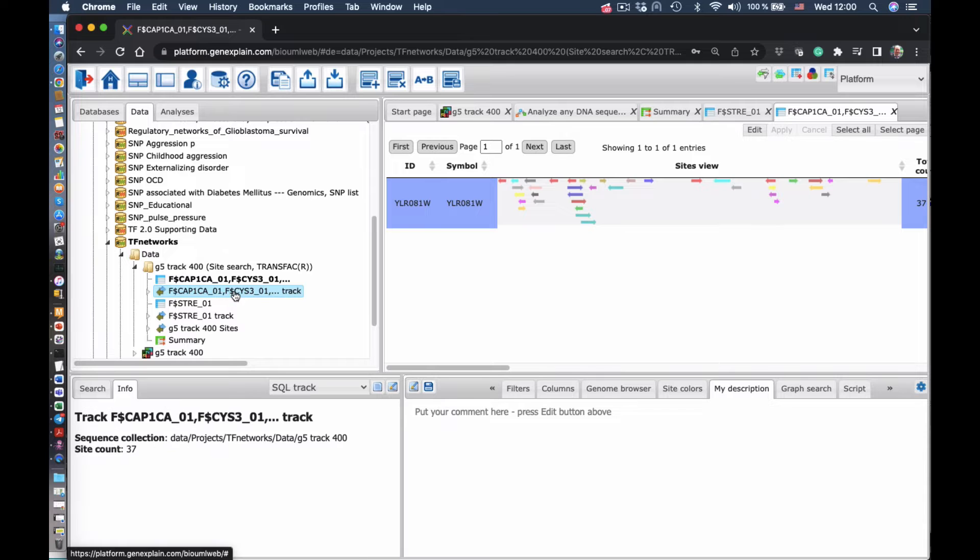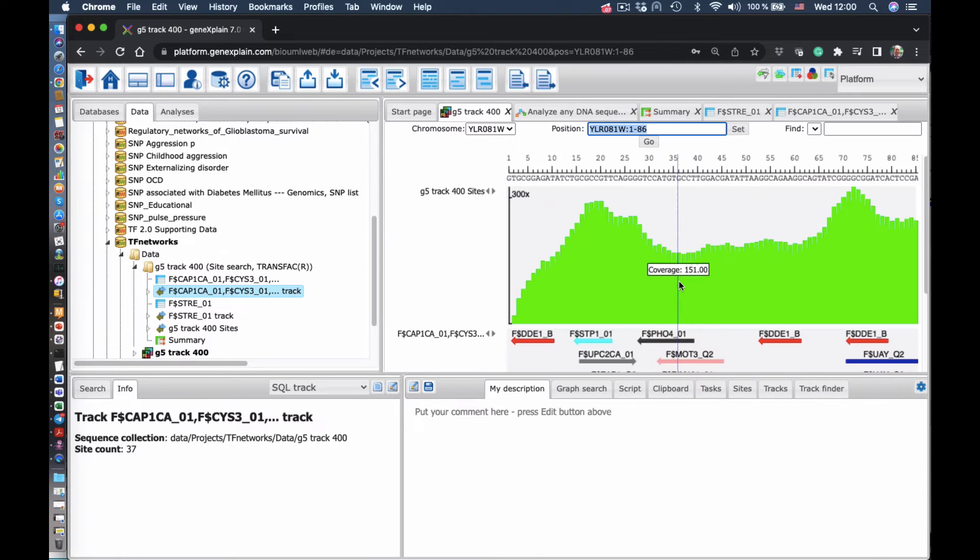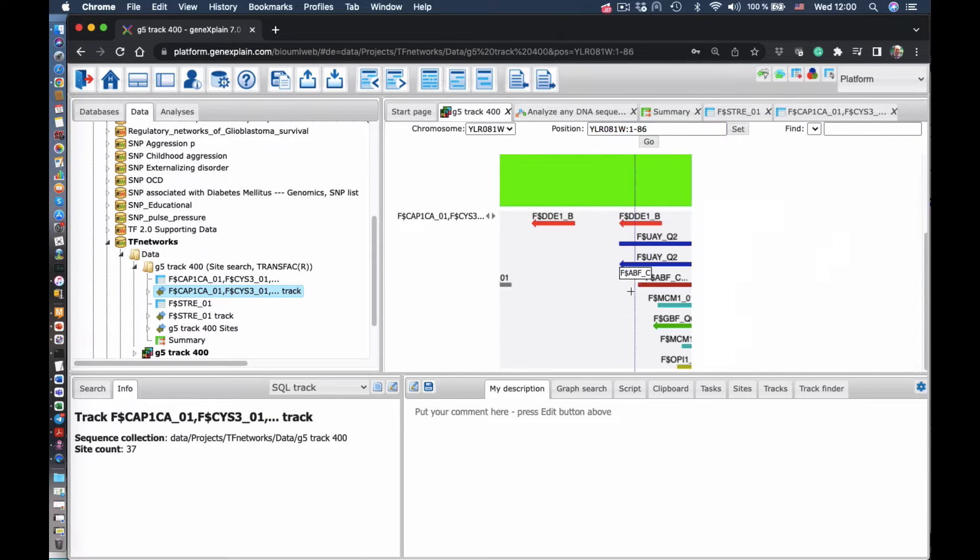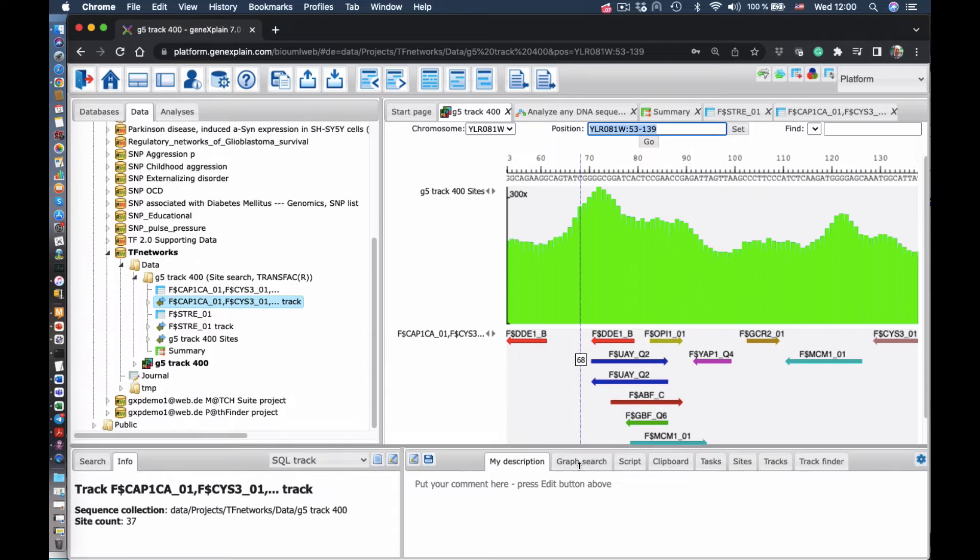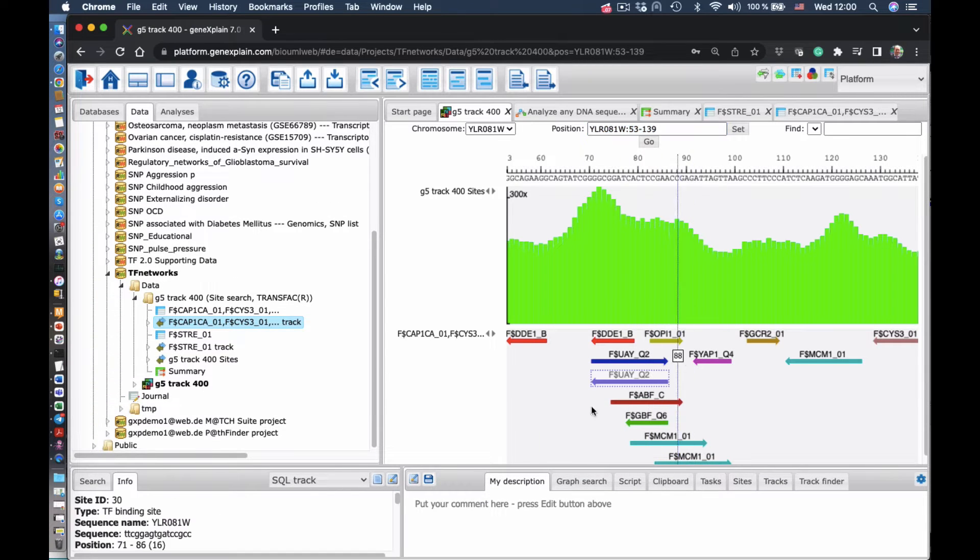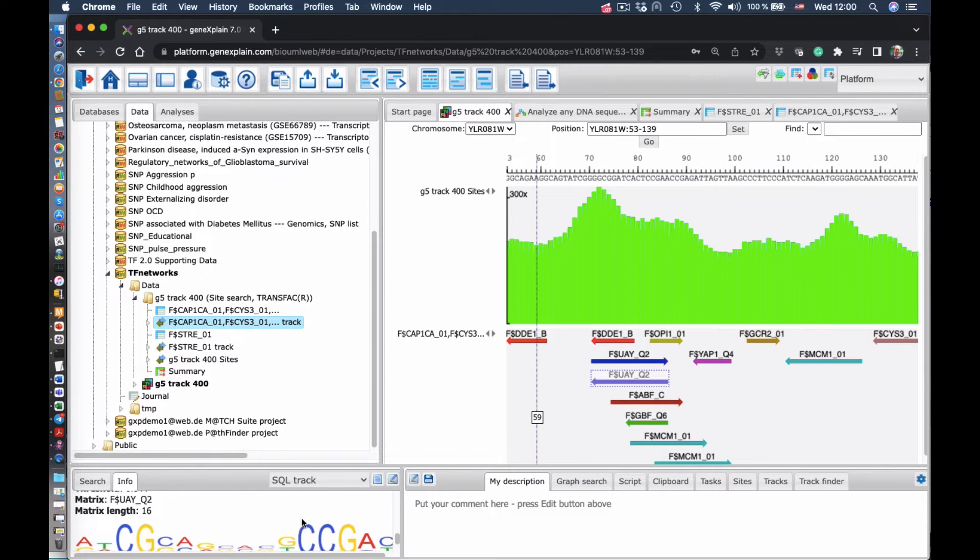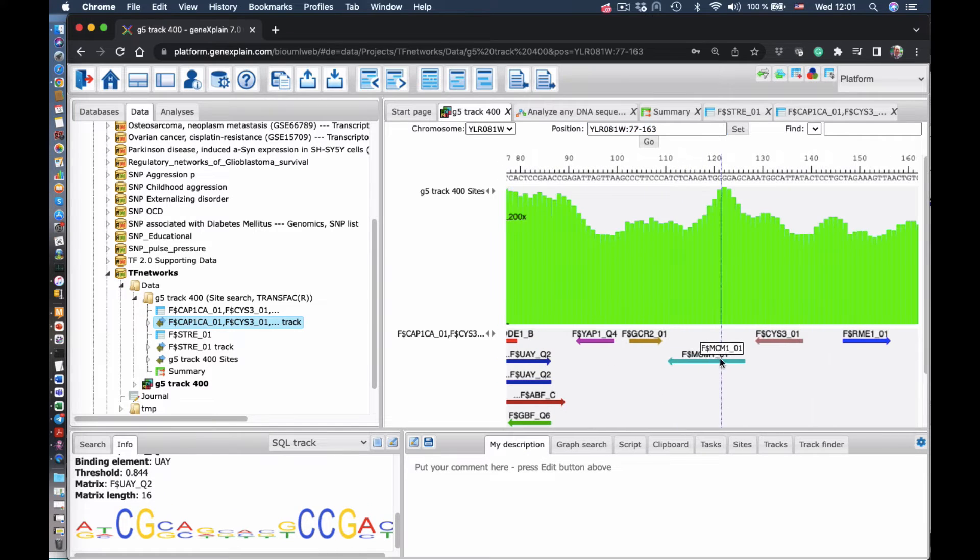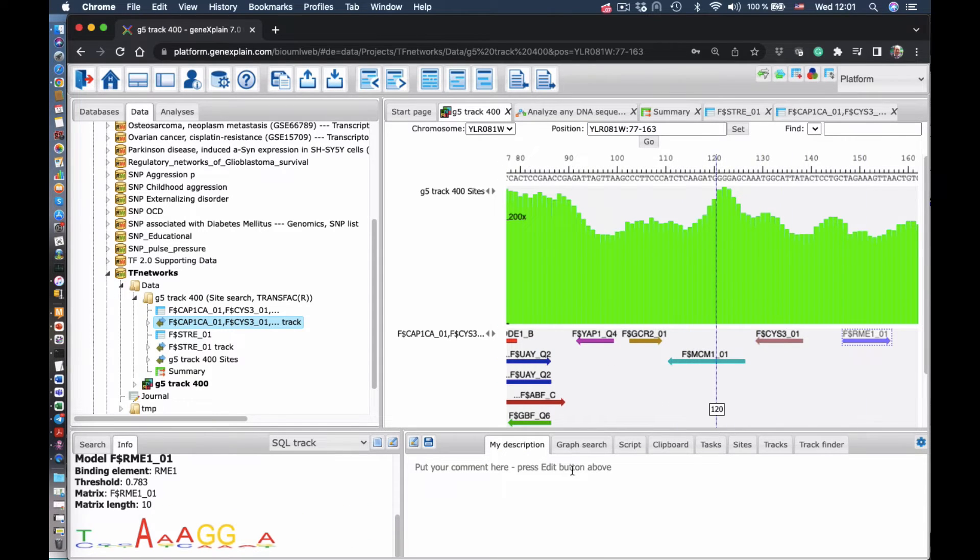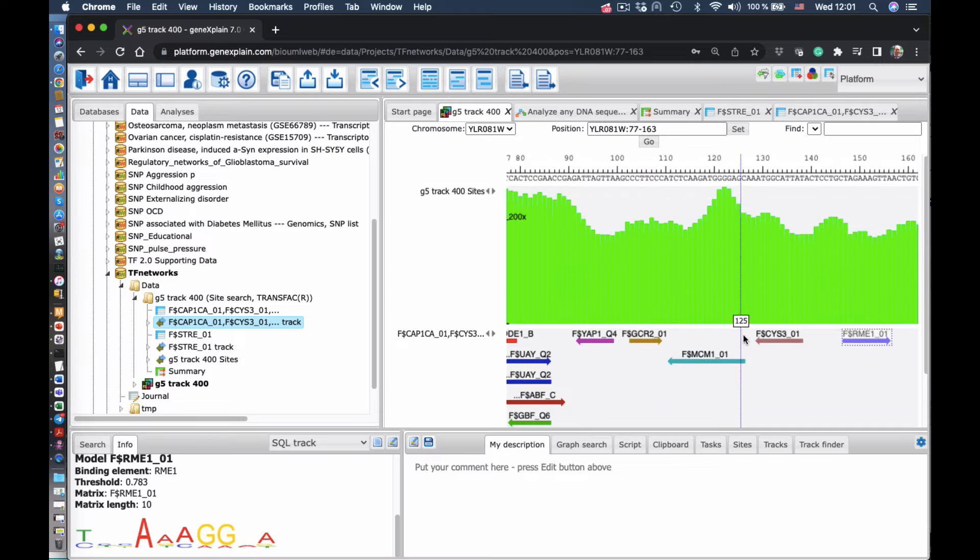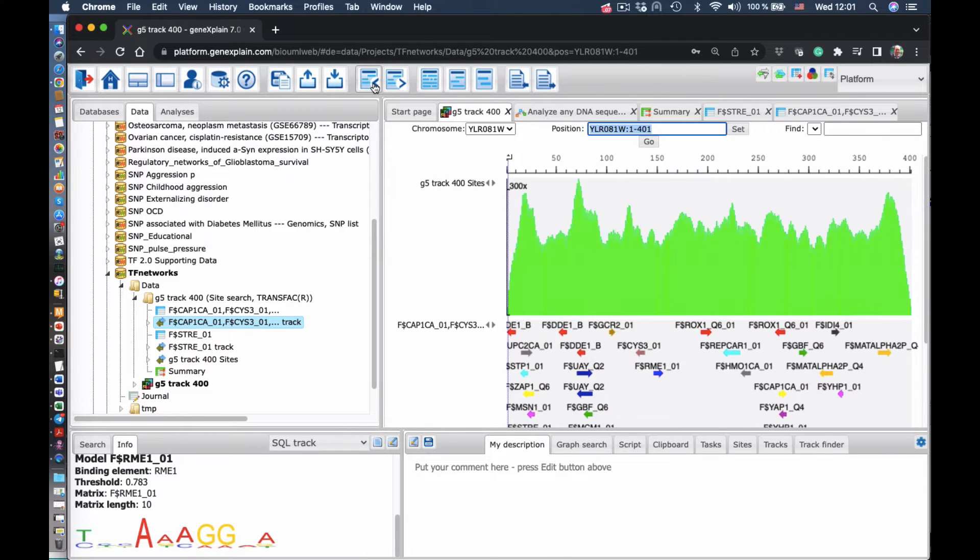Moreover, we can go inside that folder and see those sites in more detail. So in the genome browser, here the green peaks demonstrate the frequency of the sites overall found in that sequence in each position. And again, we can go in each of the sites, click on them and see the information.